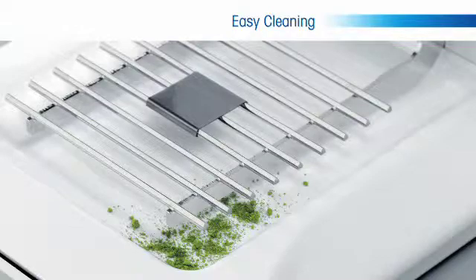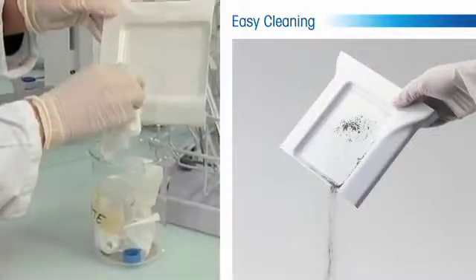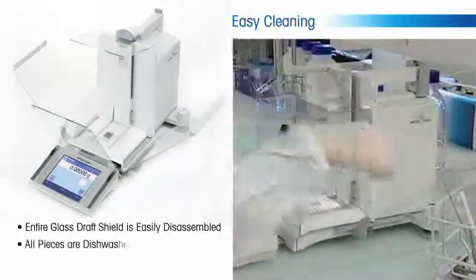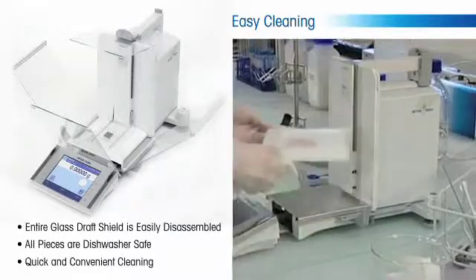Spillage does not affect the weighing process as it does with traditional balances, and any spilled sample can be easily cleaned at the convenience of the user. In addition, the entire glass draft shield is easily disassembled and all pieces are dishwasher safe for the ultimate in quick and convenient cleaning.